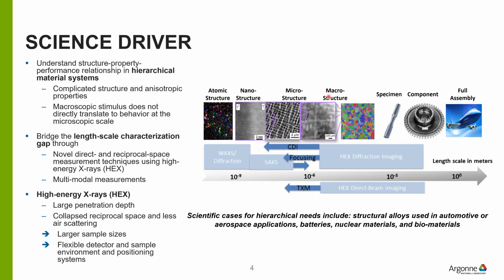The idea is the material is made up of hierarchical structures ranging from atomic structure to nanostructure to single grain structures and grains, and then leading up eventually to the full assembly, covering many length scales. So we've been developing these high energy techniques that can cover these length scales and really be sensitive to changes at the length scale so that we understand how materials behave at those length scales and how those changes affect the properties and performance of the structures, eventually to the full assembly.